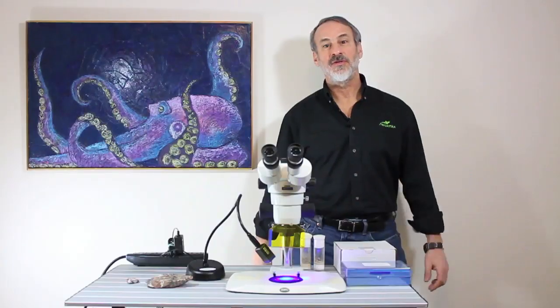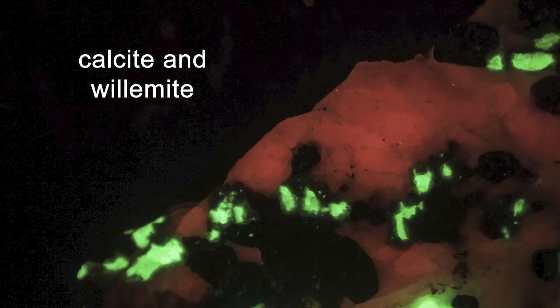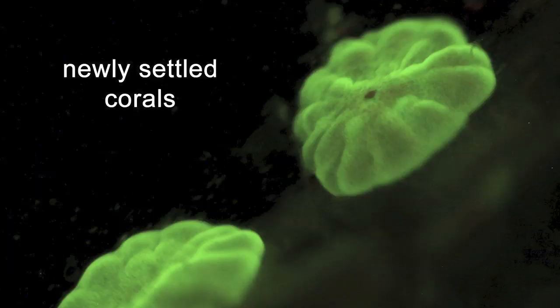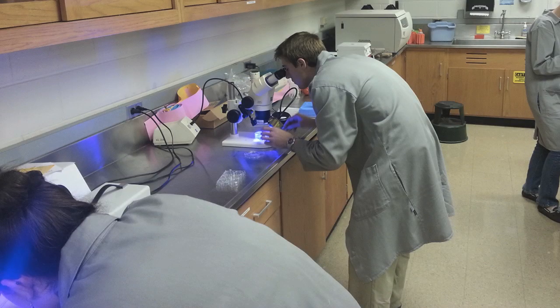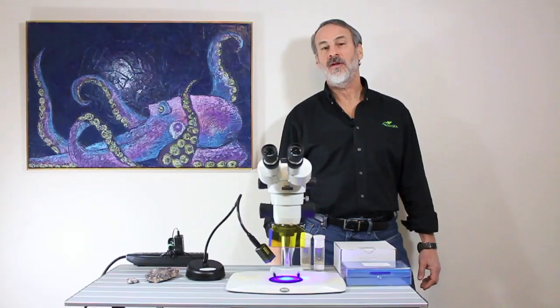Plenty of fluorescence to explore in nature: fluorescent minerals, plants, coral research. You can use the system in education, undergraduate laboratories, museums, any kind of demonstrations.